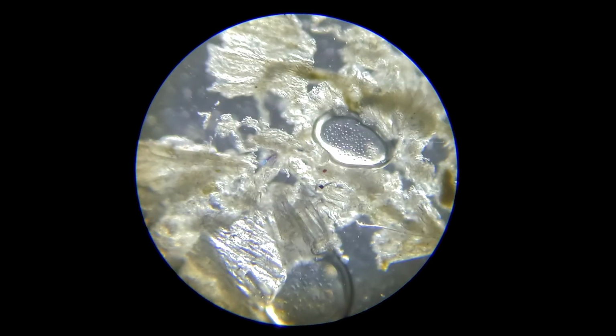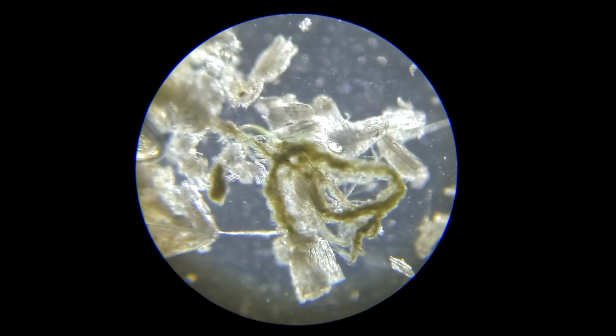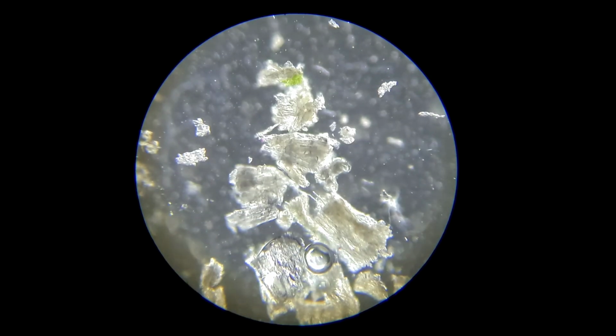This is a very common microscope mistake, confusing debris or crystal for microbes. So no, this is not life. This is just wax. And always verify before believing microscope videos online.